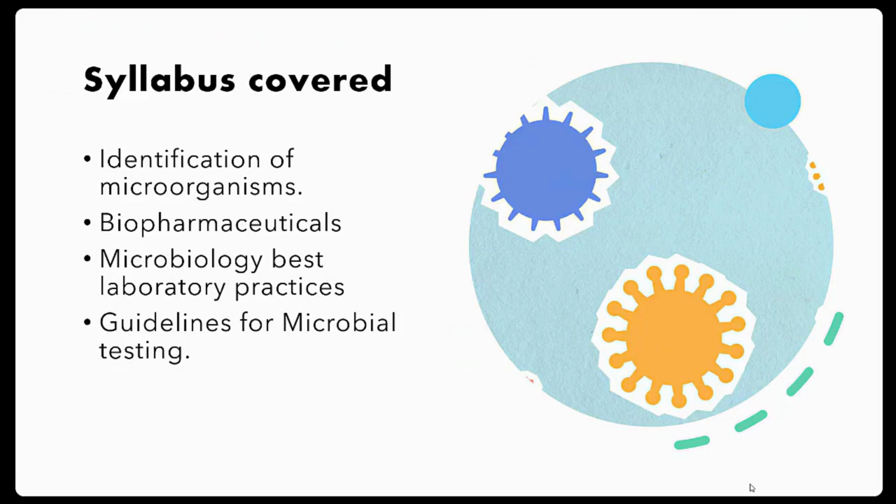Next, microbiology best laboratory practices. A microbiologist should know the practices to minimize the contaminations, to avoid the cross contamination of samples, and to avoid mix-up of the cultures. Everything he should be trained. And a microbiologist should be capable of generating accurate data, how to interpret the results, and how the precautions should be taken while handling the cultures. Everything will be covered in this section.